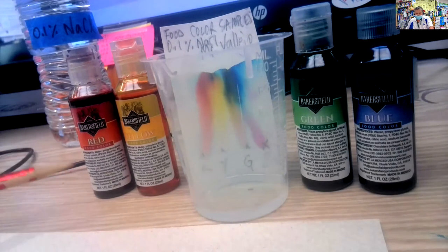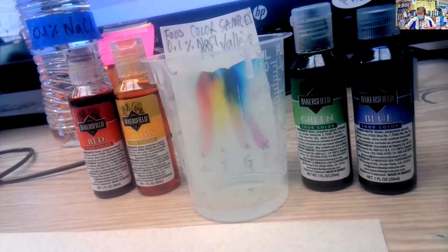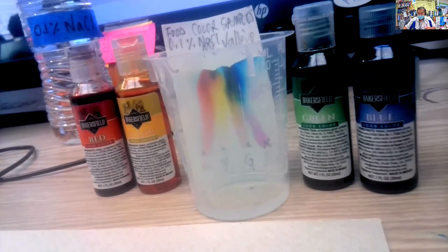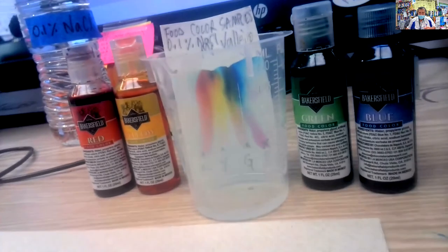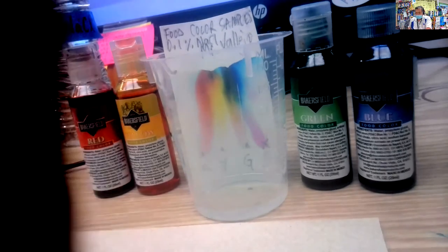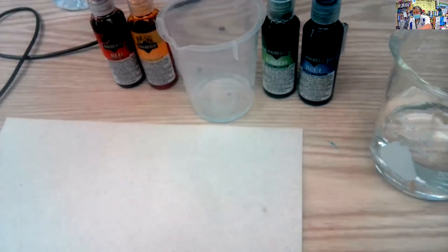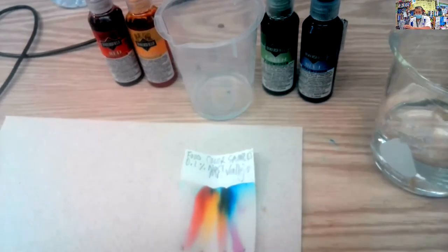As you can see, this one right here, that is artificial red. Red number, what is that, 40? Can't see. It's kind of small. It looks like red number 40. See if we can focus that a little bit better. All righty. And before you look at the labels, let's take a look at our results. I'll go ahead and take that out, just straight out. And I'm going to let that dry.